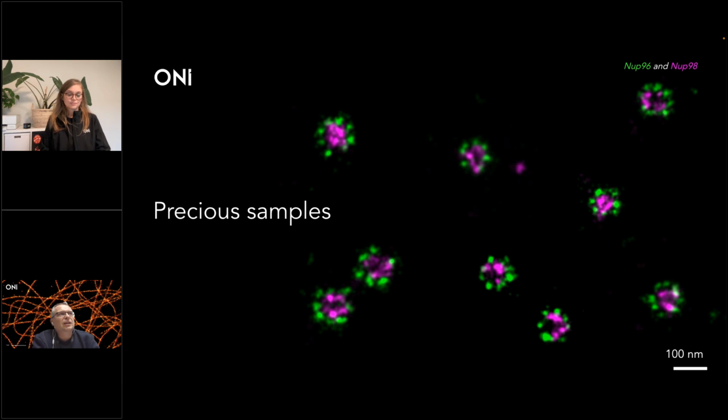Also, what's very important here, if you look at a Petri dish with a glass bottom, it will accommodate approximately half a ml of liquid. So in this case, you might not want 1,000 cells in half a ml, it's too much. So you want to reduce that. When you have very small volumes, I recommend using dishes which can accommodate a minimum of like 20, 30 microliters or even 10.